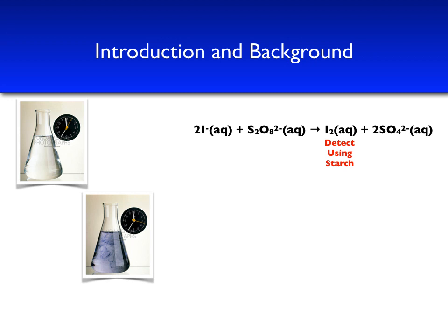You might have used iodine to react with the starch in potatoes in a biology class in high school or middle school. So this is the same principle. Iodine will react with the starch solution to form a bluish-black color.